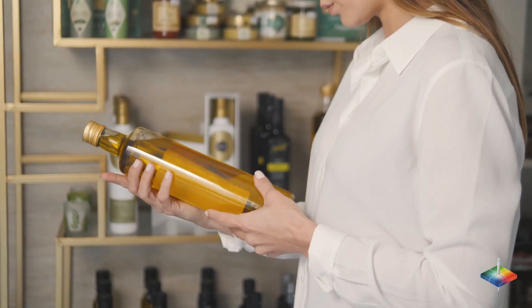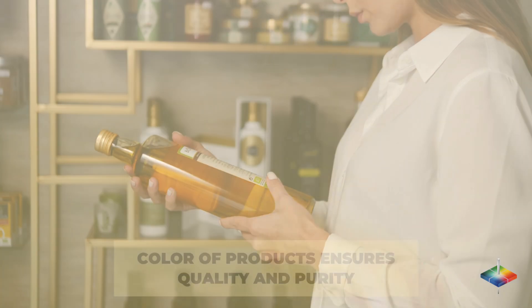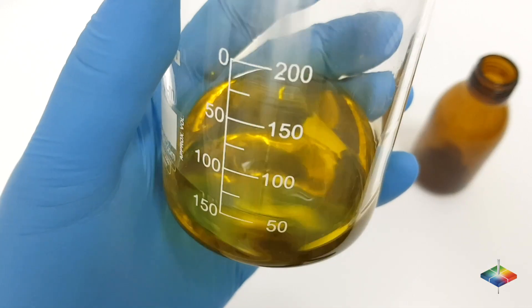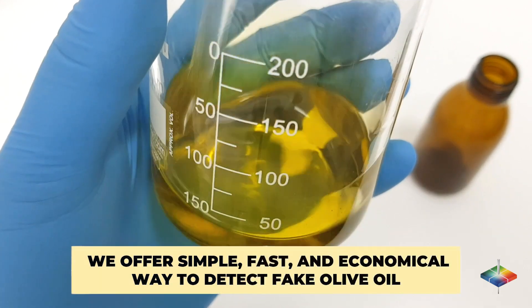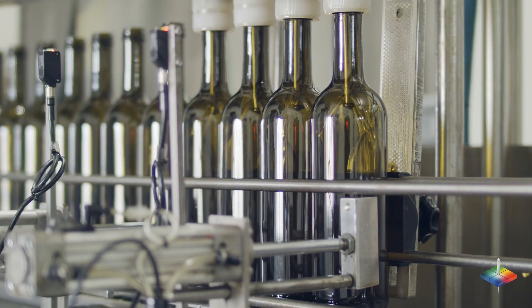The world's leading olive oil manufacturers pay close attention to the color of their products because that ensures quality and purity. Hunter Lab's color measurement solutions offer a simple, fast and economical way to detect fake olive oil, helping companies maintain and expand their market share.